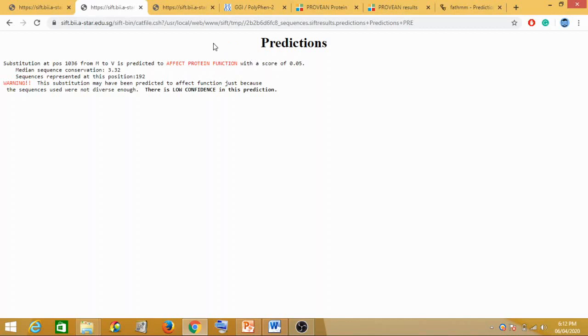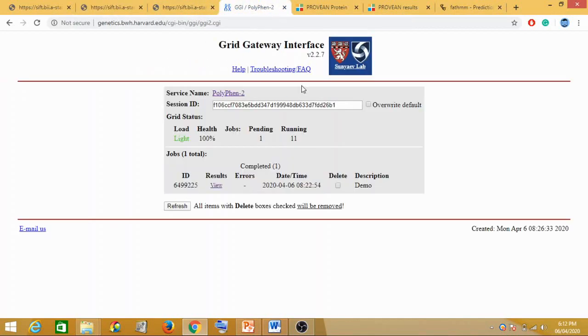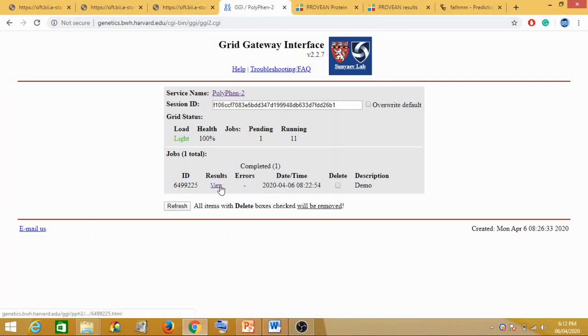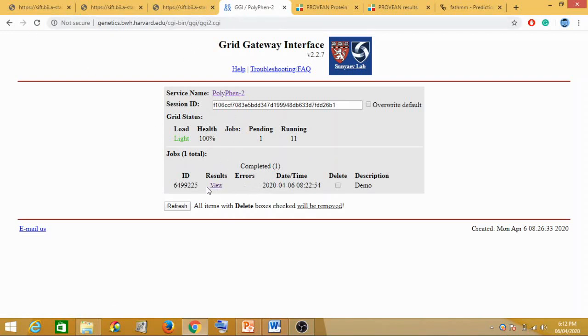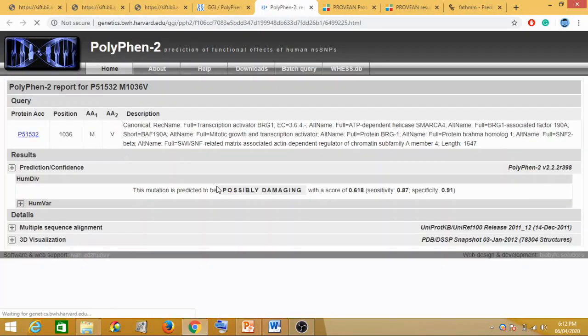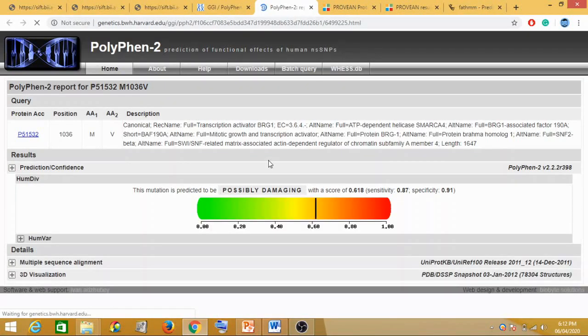Now let's go for the PolyPhen one. This is your PolyPhen result. This is the ID, this is the description. Your results is viewed, and if it does not work properly, errors will show here. At this time, you can just refresh and do it again. This is your results, you click here, click on view.